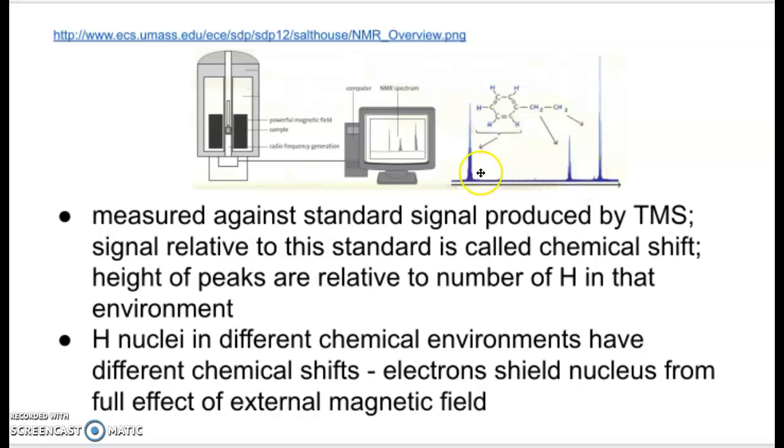So we're measuring how much energy it takes to the left of 0, which can be a little confusing, but that's how they're set up. Tetramethylsilane is used as the 0 mark, and it talks about that a little bit in the packet, so you'll want to take a look at that. And then all these other chemical shifts, or hydrogen peaks, are listed here.